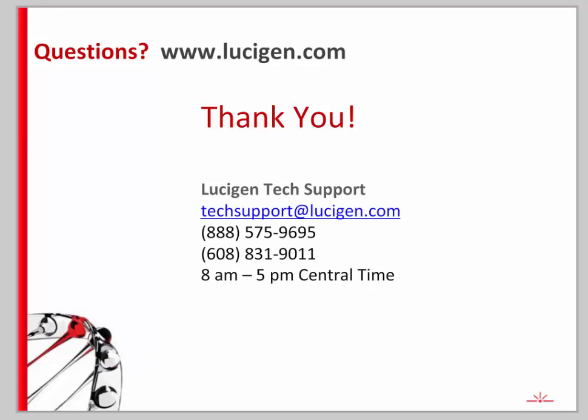I think most often people will use BL21 type cells, so we can check if we have any data internally, but I don't believe SS320 is commonly used here at Lucigen for protein expression. So we usually use our BL21 or other strains that are associated with the promoters that we're using.